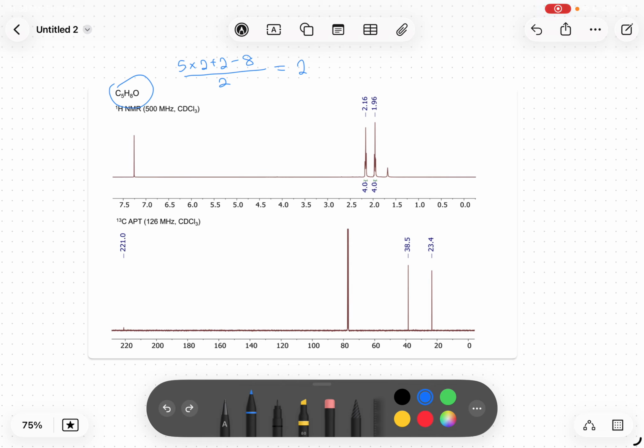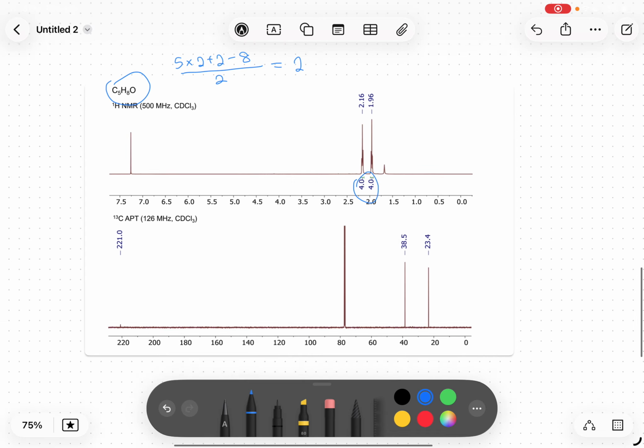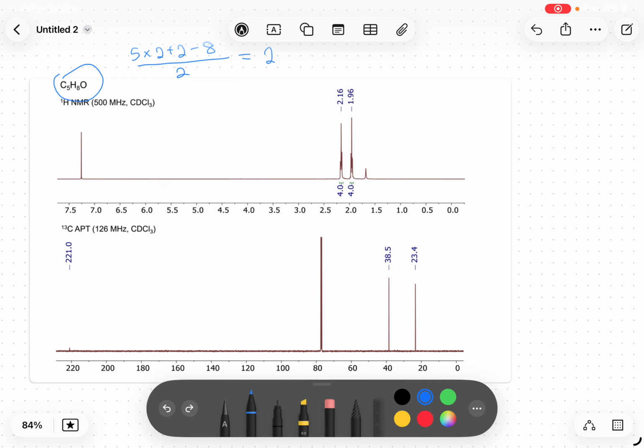So here we can take a look at the proton NMR first. We see that all 8 hydrogens are accounted for here. These 2 peaks, you don't need to bother about them. When they don't label peaks like this in the NMR challenge, it means that they're impurities or solvents. So you just need to care about the labeled peaks, the ones with the integrations, because those are the peaks that have quite a high count. They're not impurities because you have the hydrogen count and they're quite large and proportional to each other.